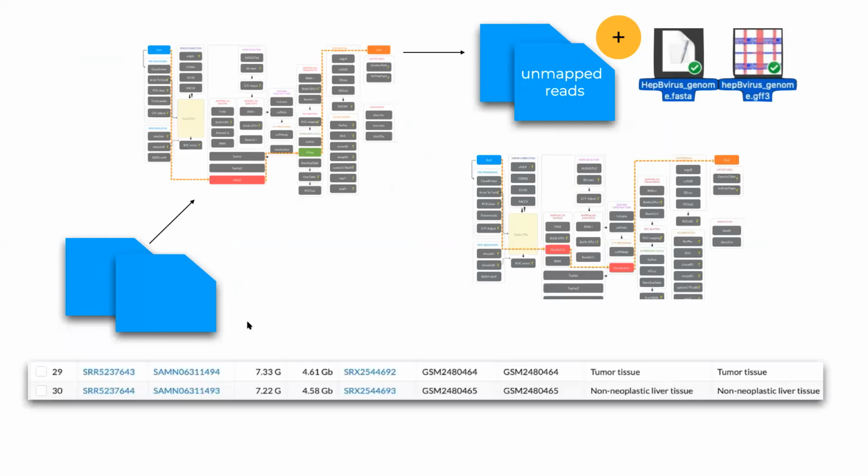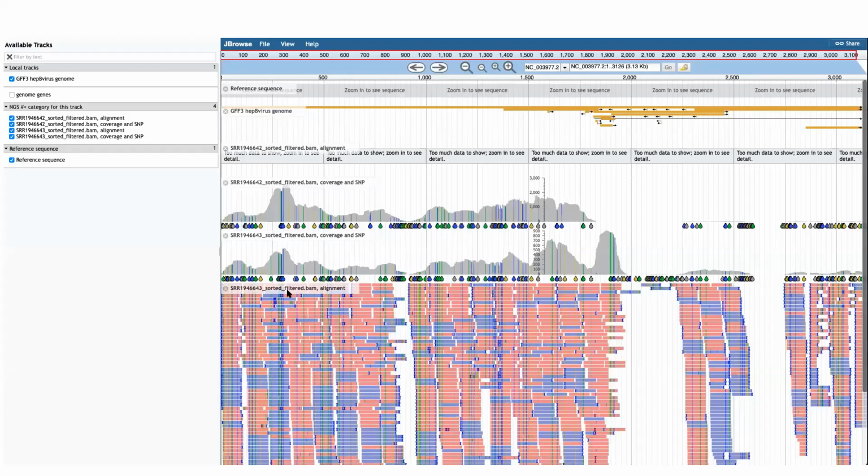Here we take these two samples and run it again, and we can see that this difference is actually amplified. You can see the same thing, but the end is right here. Again, the scale becomes different, but what we see is this important signal peptide being present in the infected tumor sample.